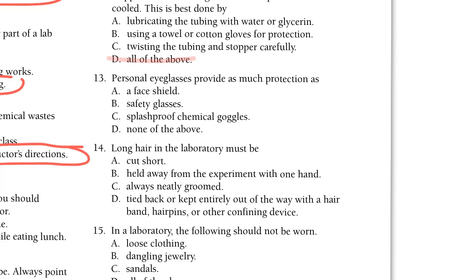13. Personal eyeglasses provide as much protection as a face shield, safety glasses, splash-proof chemical goggles, or none of the above. None of the above. Right. Just because you have glasses doesn't mean your eyes are protected. 14. Long hair must be cut short, held away from the experiment with one hand, always neatly groomed, or D, tied back or kept entirely out of the way with a band, hairpins, or other confining device.